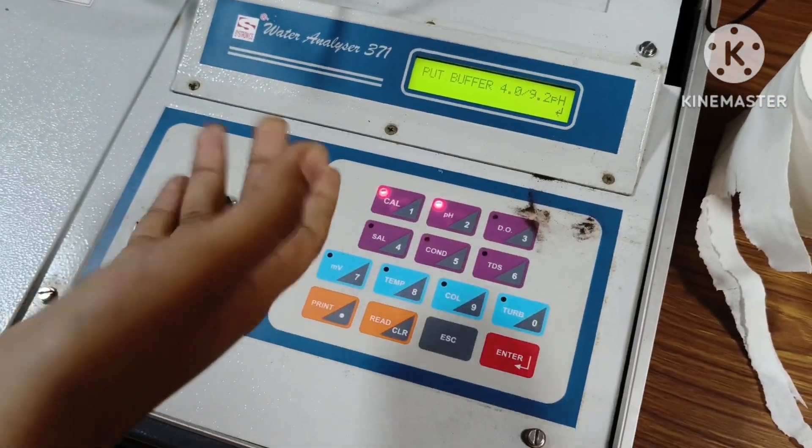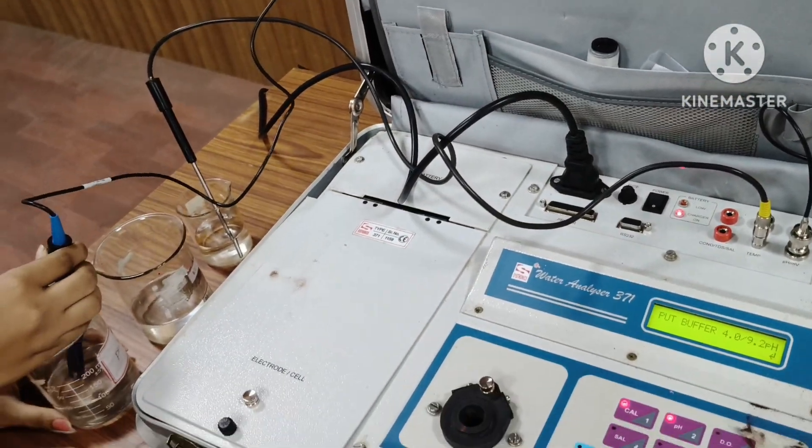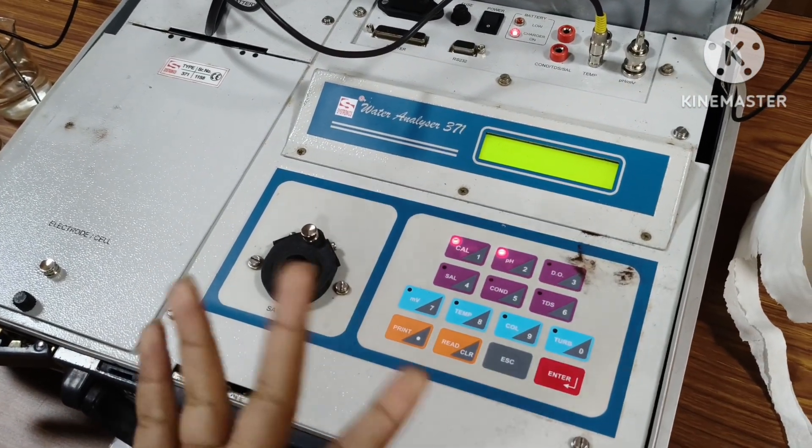Now we can see the device is telling us to put the electrode into the pH 9.2 solution. We press enter and wait for a second.